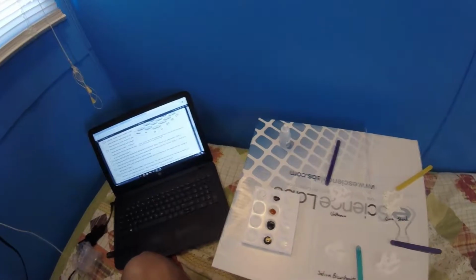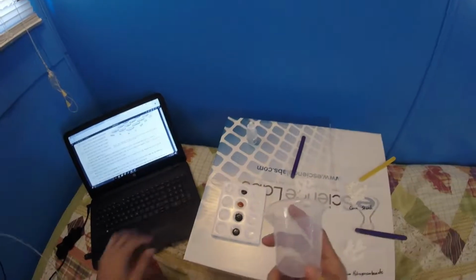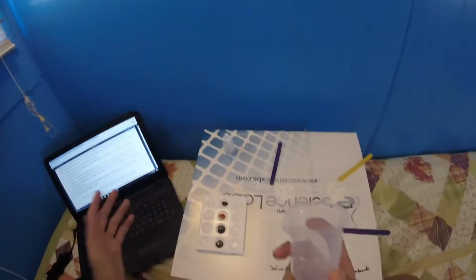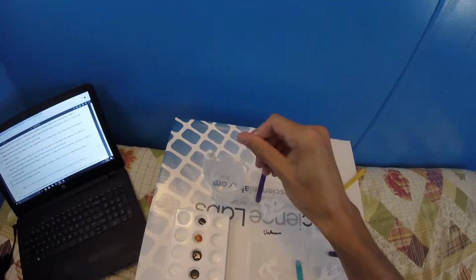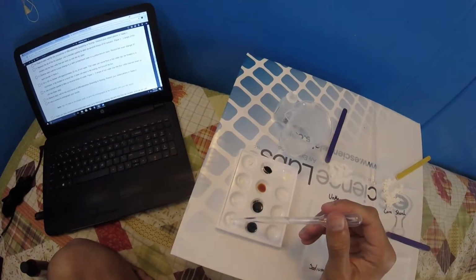So now we got to fill the 100 milliliter beaker with approximately 20 milliliters of hot water, and put several drops in the water section. So we'll come back to that after I get the hot water. Okay, so now I got the hot water. Take some of that, put a couple of drops into each one of these.